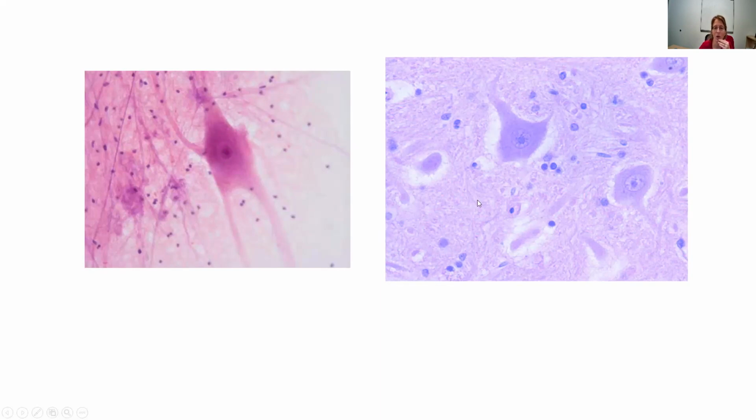So regardless of what the background and the matrix and all the other things in there are doing, if I can find a big cell that looks like it has an eyeball right in the middle, it's a neuron. So this is neural tissue, nervous tissue. Some of the littler cells around it are glial cells, the neuroglial cells that support the neurons, but the big ones with the eyeball in the middle, that's a neuron. That is how I always tell nervous tissue. They look kind of like little aliens, maybe a little Mike Wazowski, whatever helps you.